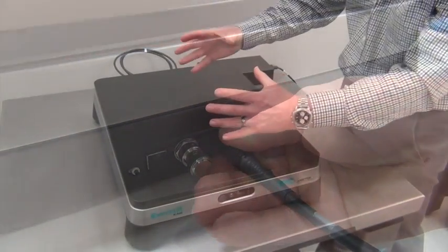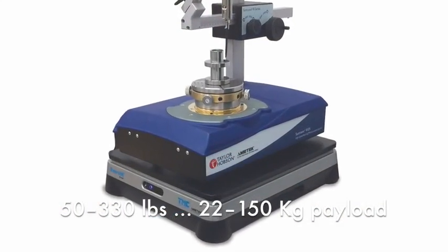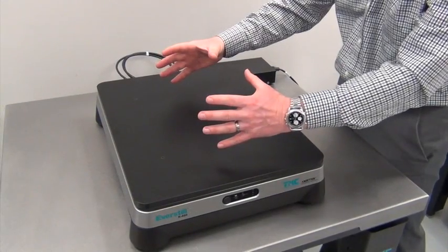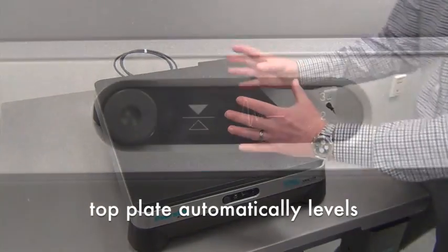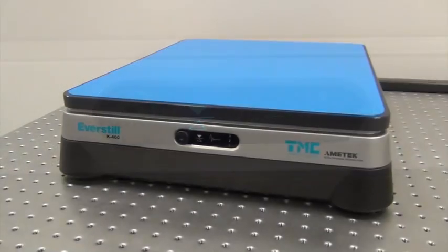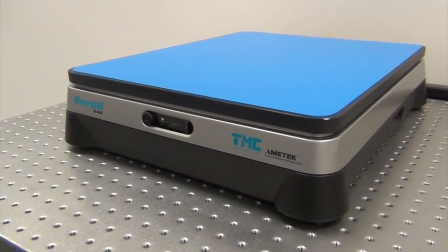The K400 is designed to support instruments weighing 50 to 330 pounds, or 22 to 150 kilograms. Level your instrument if leveling feet are provided, just as you would if placing your instrument on any table. The top plate will be automatically leveled when the unit is turned on. If your instrument has a flat base, contact TMC for a base pad to eliminate the micro-wobble effect between two hard surfaces.